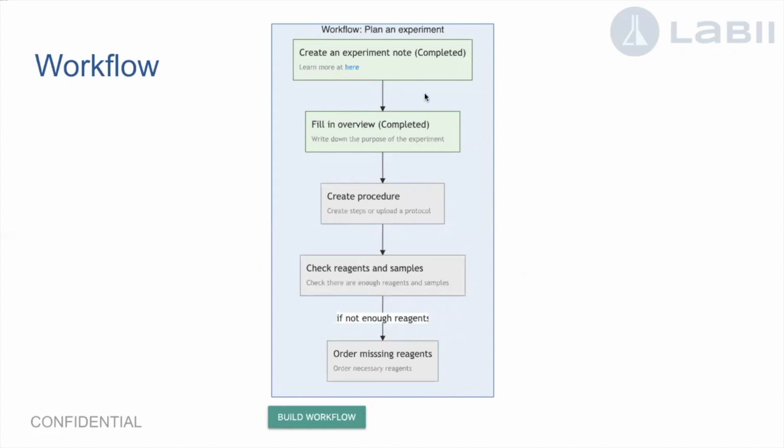As I just mentioned, you can include a description. You can reference a protocol. For example, if you need to follow one particular protocol, that can be a link. When you click it, you can check what the protocol looks like. And for each step, you can check how it's been done, and whether it's been finished or not.